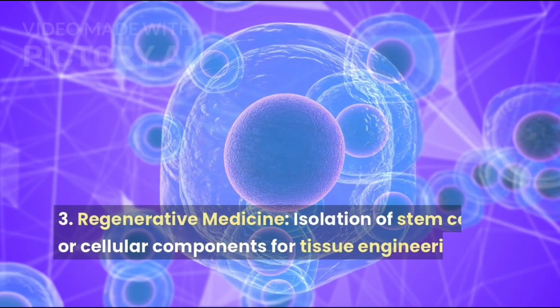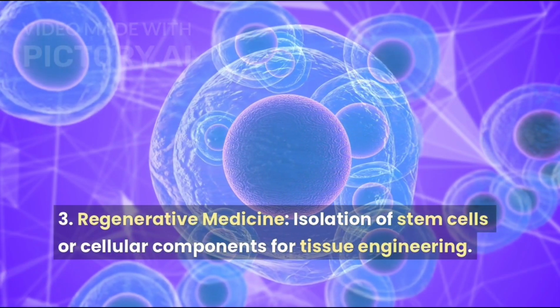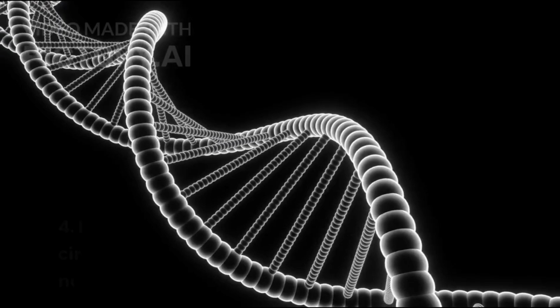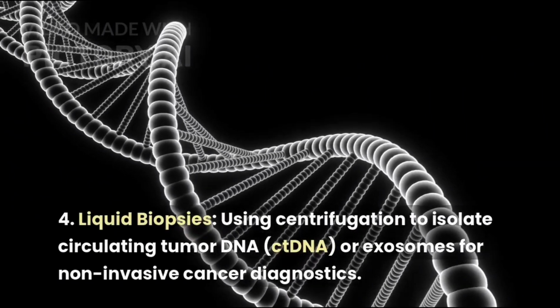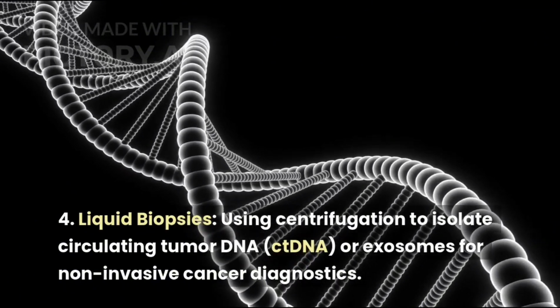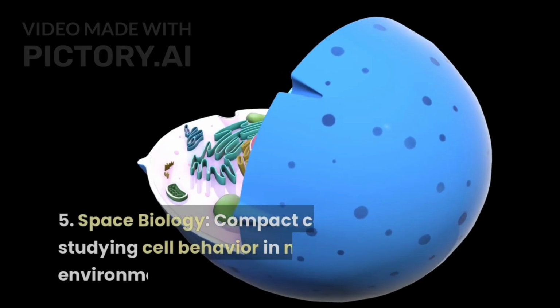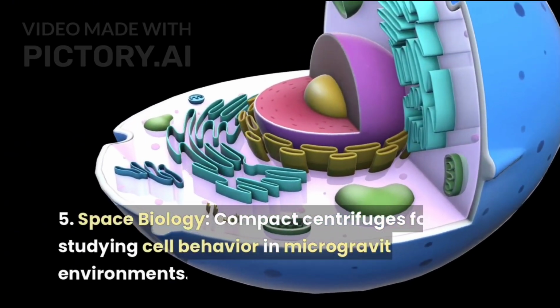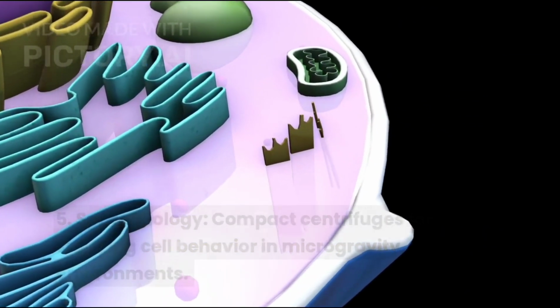Number 3, regenerative medicine, isolation of stem cells or cellular components for tissue engineering. Number 4, liquid biopsies, using centrifugation to isolate circulating tumor DNA or exosomes for non-invasive cancer diagnostics. Number 5, space biology, compact centrifuges for studying cell behavior in microgravity environments.